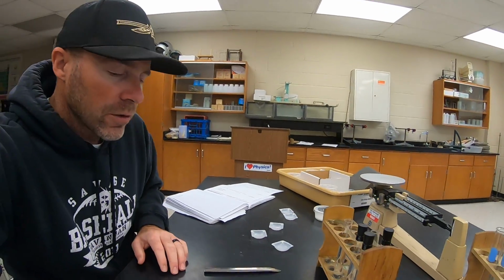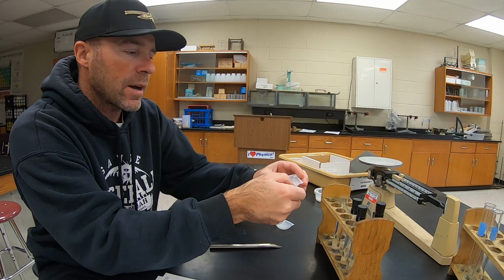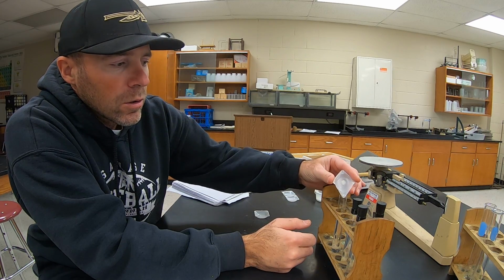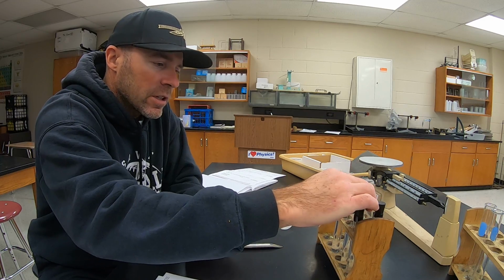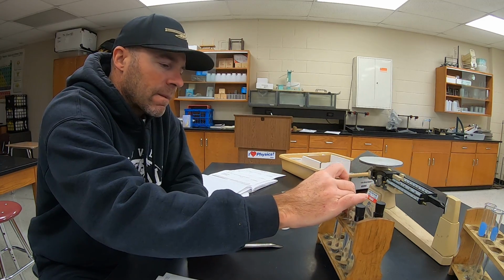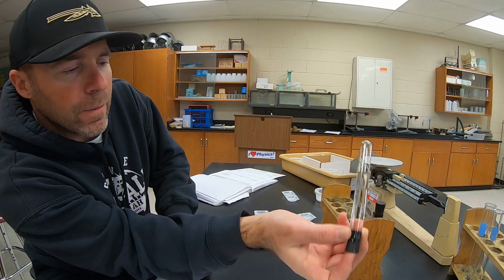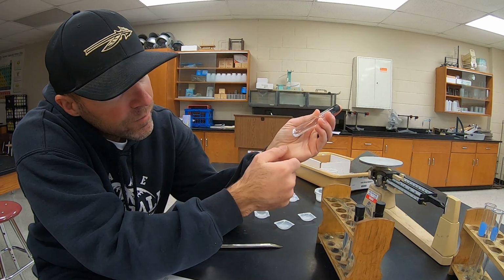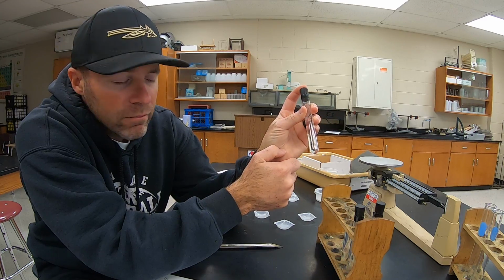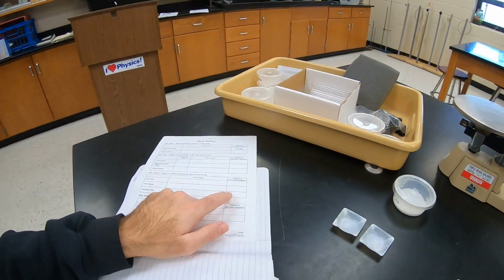And then we'll do powdered salt. So I have, again, 0.2 grams of powdered salt. We'll pour it in, take the lid off one of these, and invert it. And it only took 1. Okay, so you'll put 1 here for powdered salt.